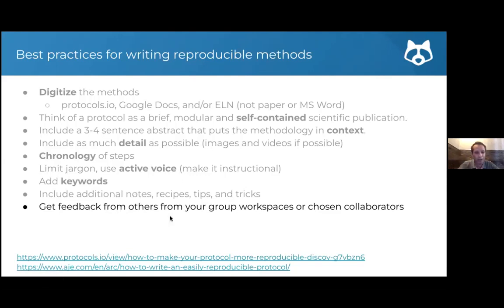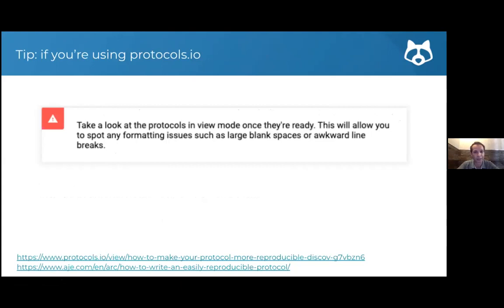Have someone scan through and tell you, "Ooh, you're missing the concentration here. I don't know where you ordered the antibody. What version of the software did you use?" Really quick, really helpful feedback.